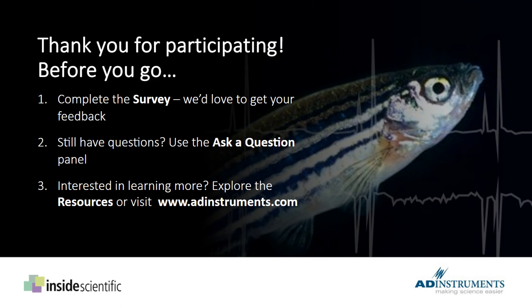Our next question is, this person has said excellent presentation to start. And then, have you tried drugs that increase QT interval, and were you able to record TdP? Awesome question. Yes, there are drugs that increase QT. Absolutely. And actually, we did publish that. H2O2 that we presented today is an agent that can actually prolong QT.